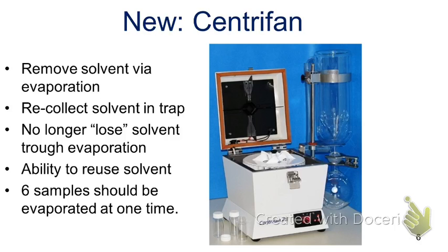Okay? This instrument can hold 6 samples. We ask that when you use it, you keep it fully loaded. Okay? That it is filled with all 6 samples. Otherwise, half your class is going to be really upset when you run just 1 sample in it. Okay? Because they have to wait for you to finish.